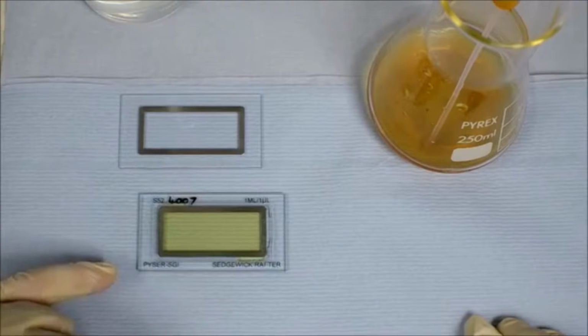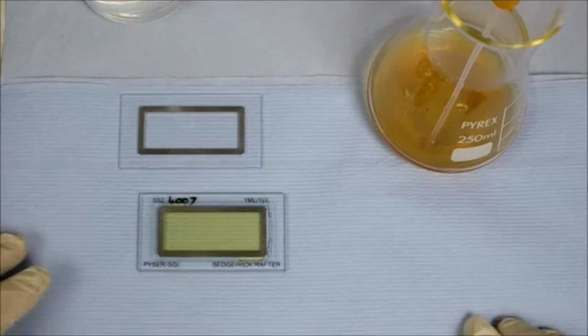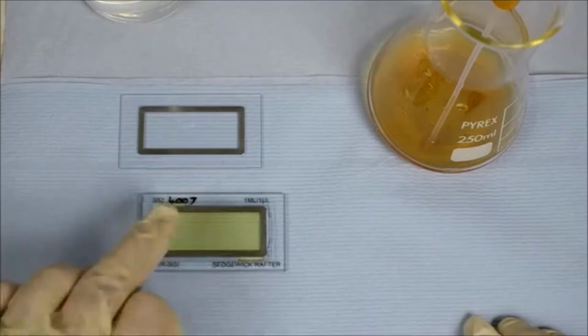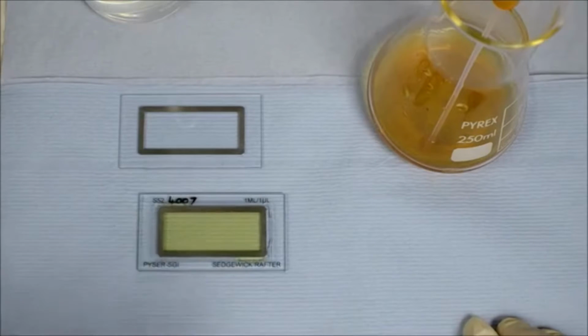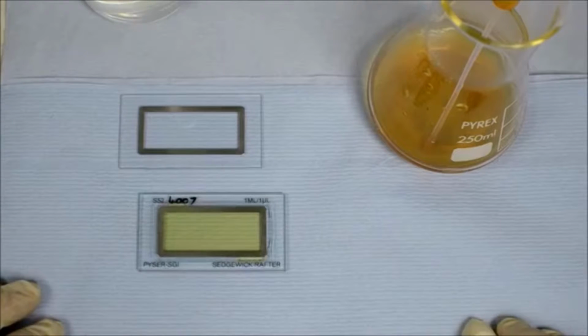Now, the gridded version, on the other hand, has no need for a reticule at all. The square pattern on the floor of the chamber becomes the guide. It's ideal for use with a stereo zoom microscope without the need to carefully set up the precise zoom or magnification before counting the sample.